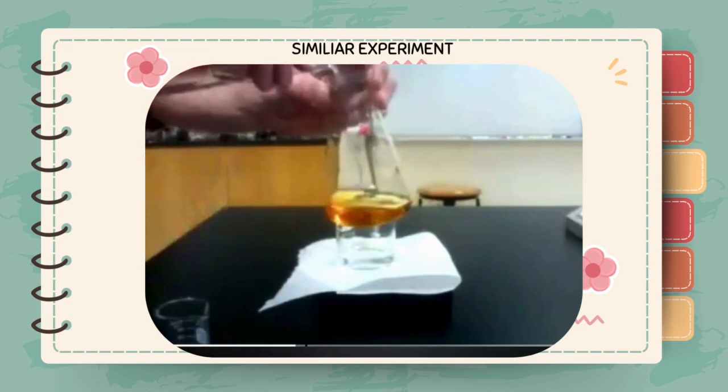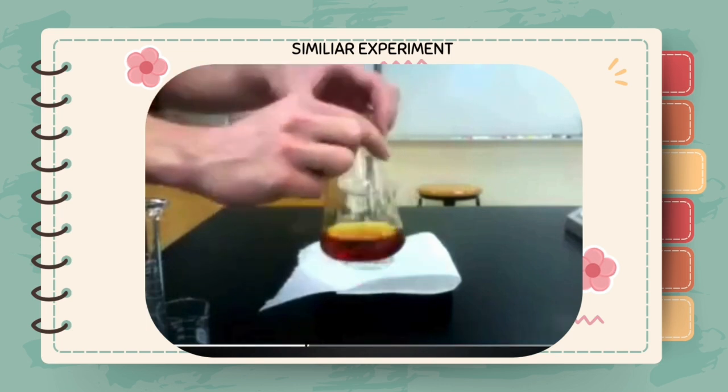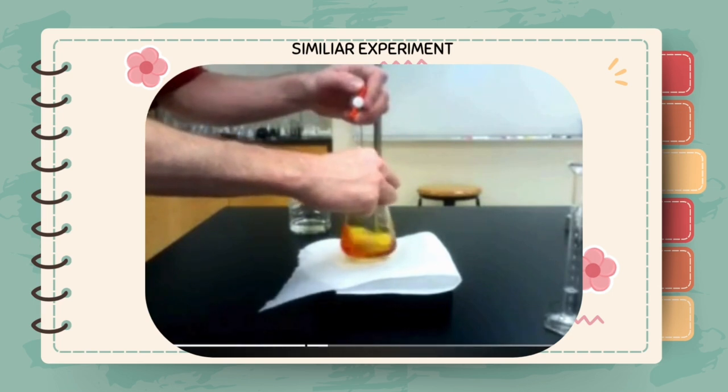The amount of hydrochloric acid does not need to be measured with great accuracy. Using a graduated cylinder is acceptable. For your first titration, you may wish to do a rough titration to get an approximate endpoint. If you are doing this, you will want to add the starch indicator immediately at the beginning of your titration.